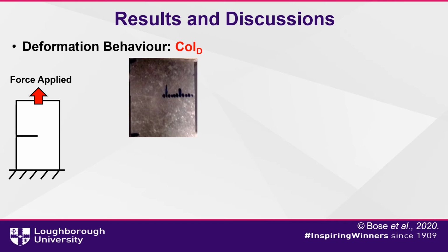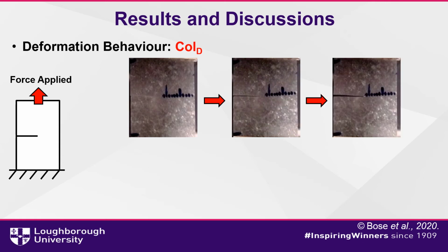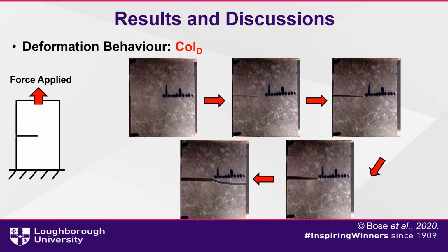This figure depicts the initial pre-crack introduced in the specimen. With the increase in tensile deformation, the crack propagation begins. The crack propagates rapidly with very little plastic deformation, which is accompanied by a brittle failure. Hence, it might be said that in-air conditions lead to a rapid brittle crack propagation in collagen films.